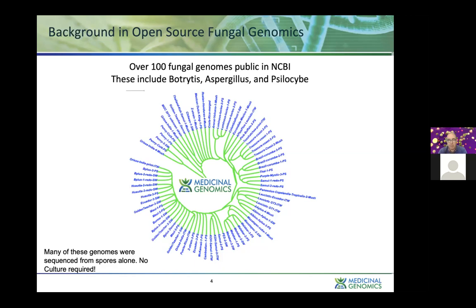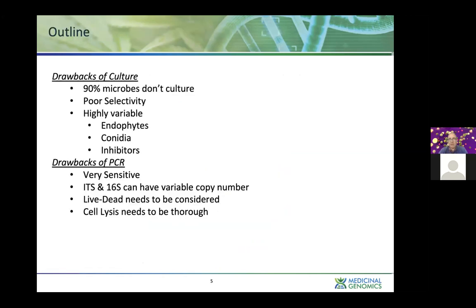to navigate this problem. Okay, so the outline of the talk today. Now we have that backdrop. There's a couple drawbacks of both platforms, and we should be honest about them. There are drawbacks of culture, and that the vast majority of microbes are not culturable. This makes it very difficult to have a total yeast and mold test because the vast majority of your yeast and mold, in fact, won't culture.